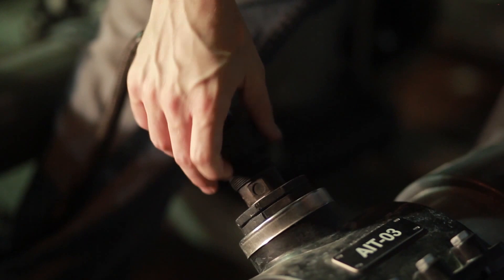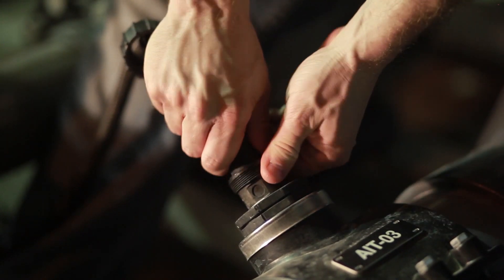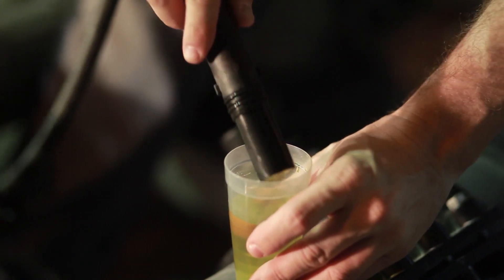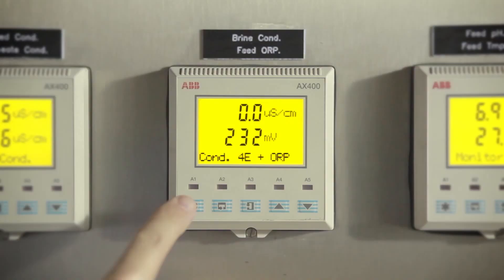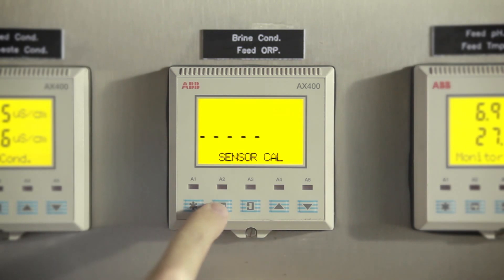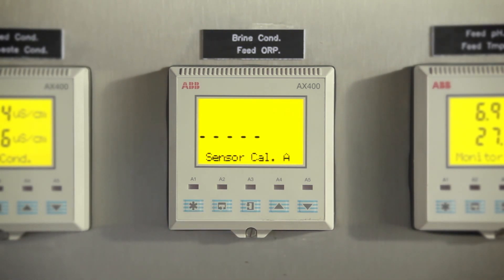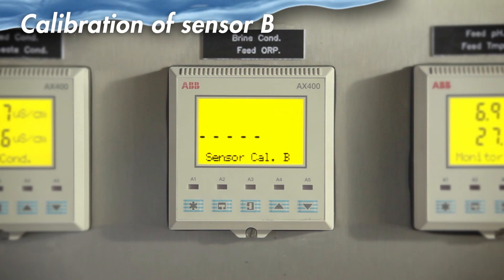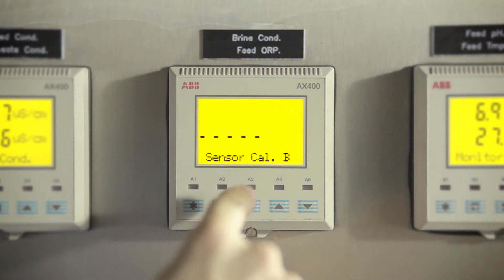To get started, remove the electrode from the line. Immerse the sensor in the buffer solution. Go to the Sensor Cal menu. Enter Page Sensor Cal A or Page Sensor Cal B depending on the required sensor. In this video, we will demonstrate calibration of sensor B.